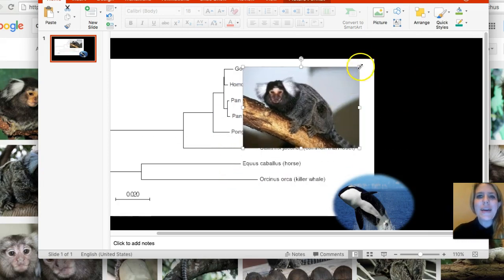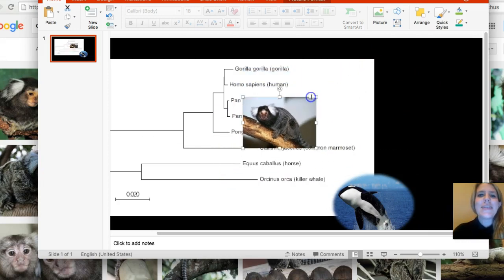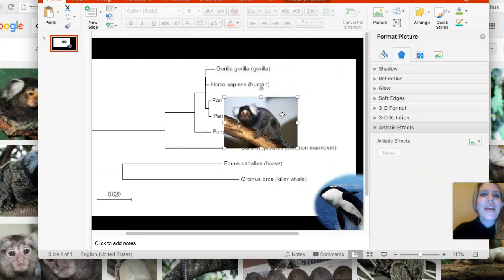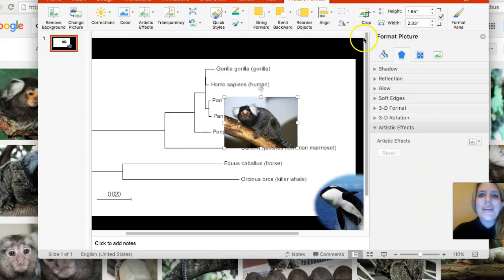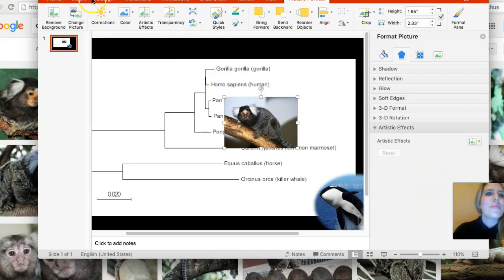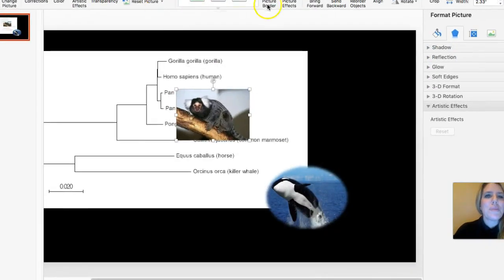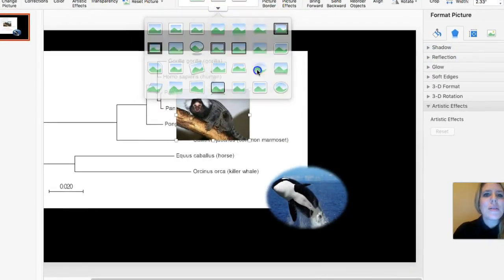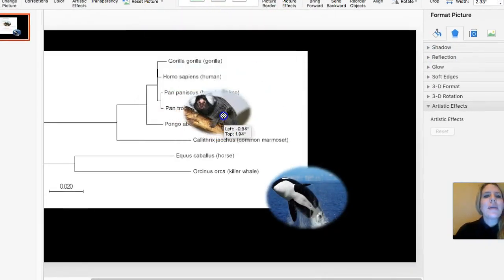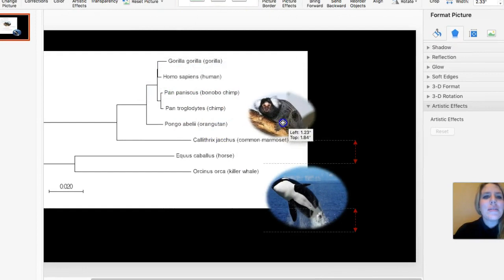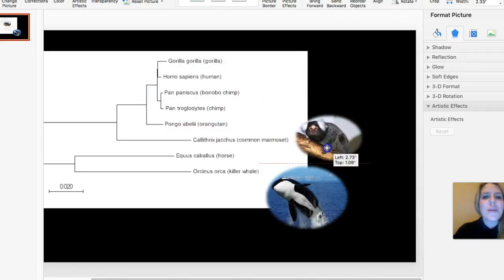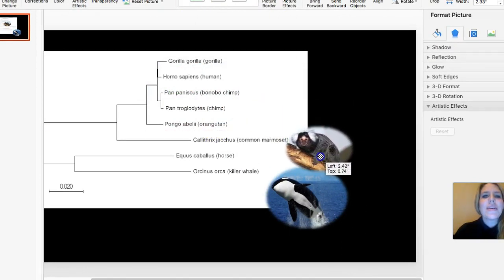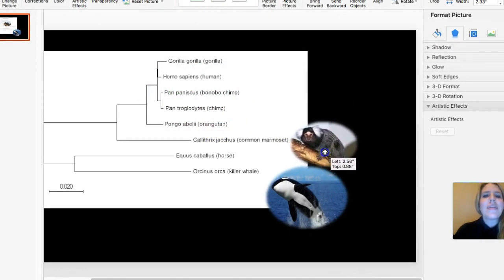Get him down, double click on him, and now you can do some pretty styles with him. I'm just going to put him next to where he is. There he is.